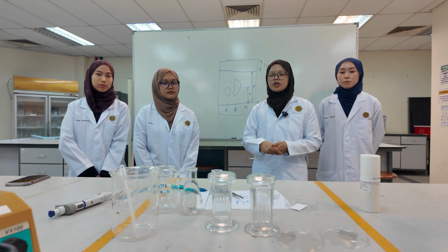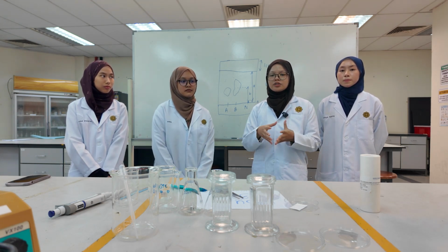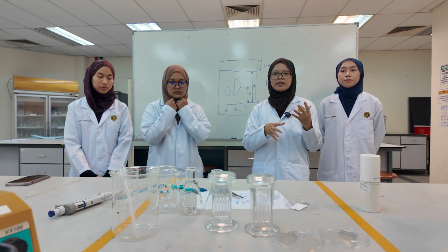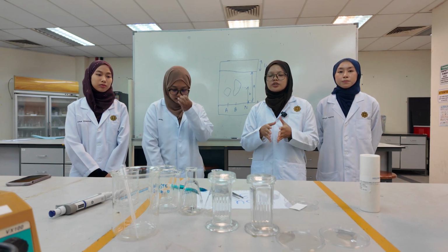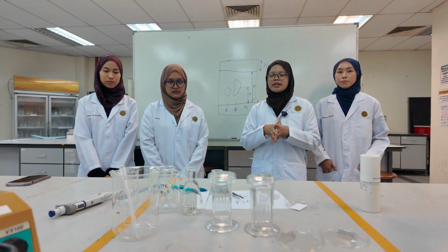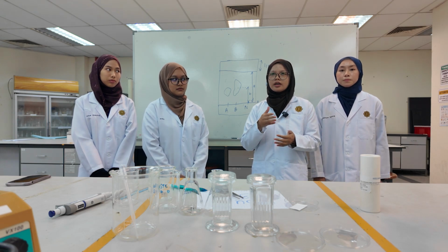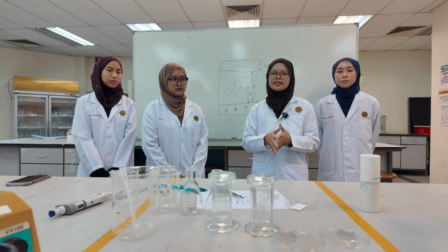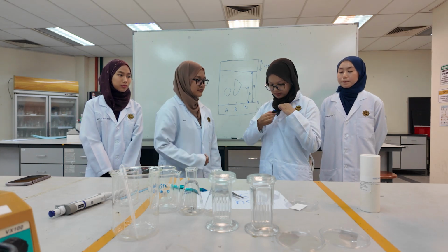And lastly, we need to make sure that we dispose of TLC plates and any chemical solution that we use in the right containers, so that we can prevent any lab contamination and also fire hazard. And that's all from me. I will pass to the next presenter.